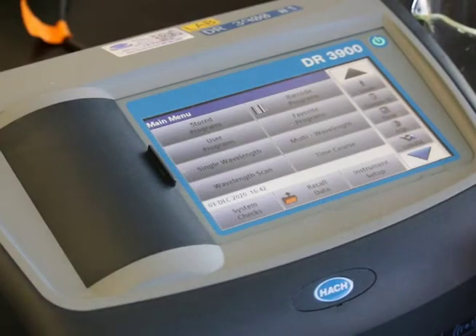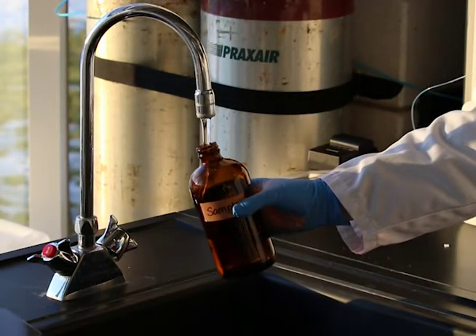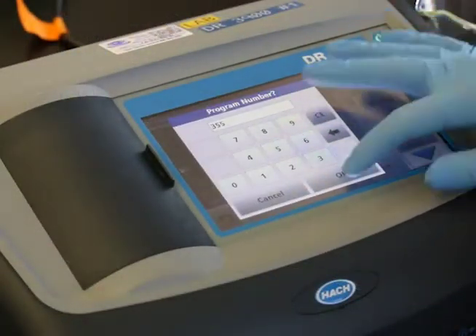We will be using a HACH DR-3900 spectrophotometer for our demonstration. Samples must be collected in clean glass or plastic bottles. Start your instrument and select the appropriate program for nitrate measurement.